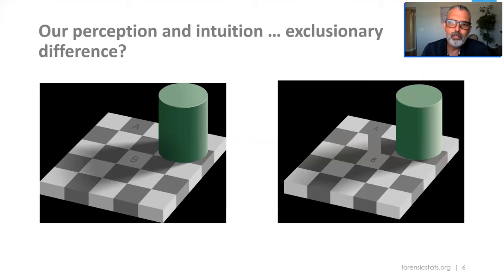But if you let anyone at CSAFE who's doing image processing point a computer at this problem, it's very easy. It just registers the grayscale in both places. So we're not so good at that. Here's another one that I encountered recently, really hurts my head.